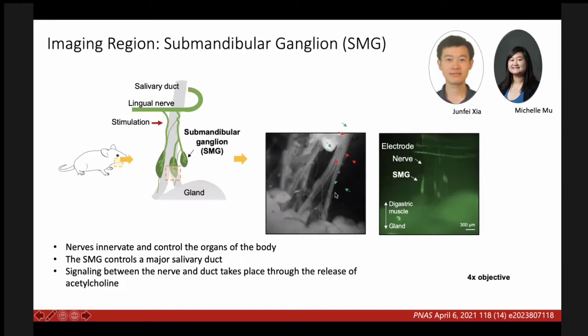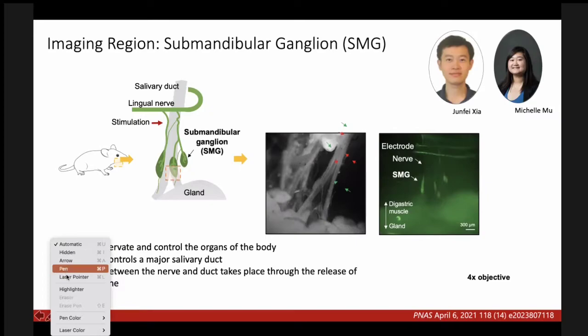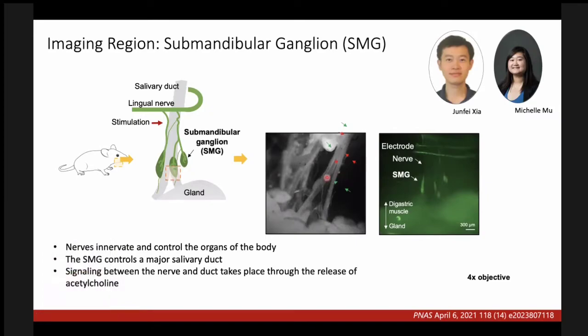And I have to apologize, my little arrows all shifted somehow on this image here, but really this is an image of what the nerves look like. And the ganglia, so these green things here, are shown in these spots here. Let me see if I can get a better laser pointer. Okay, so better laser pointer here.